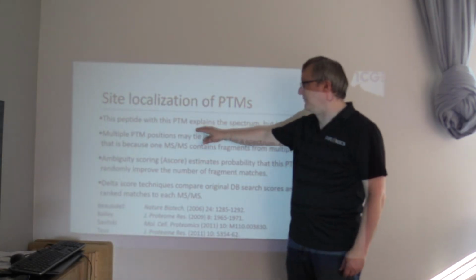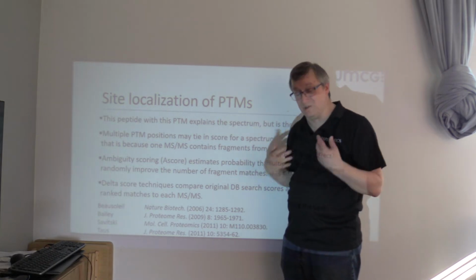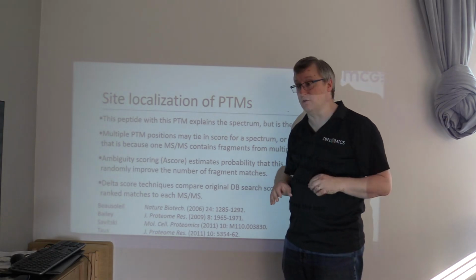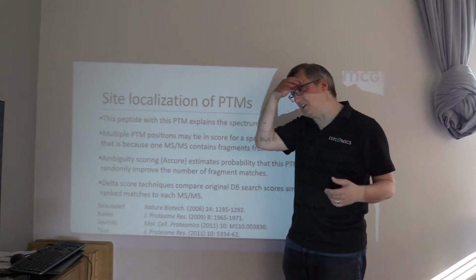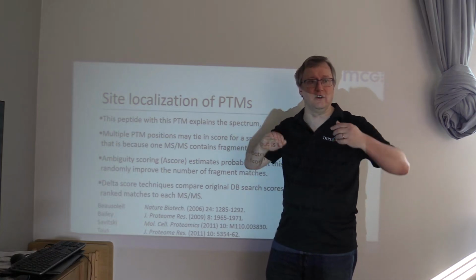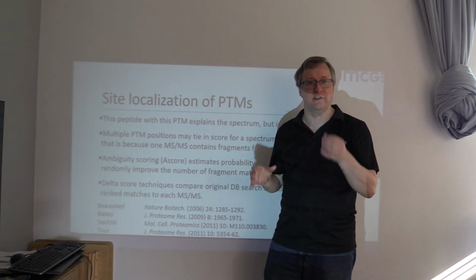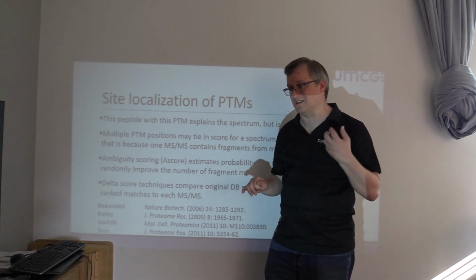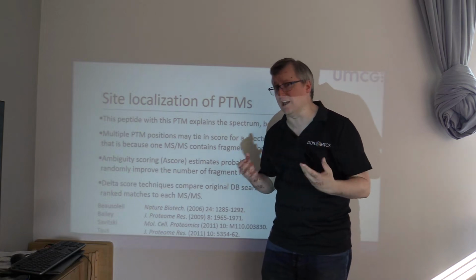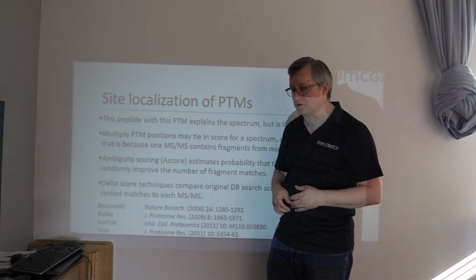So this peptide with this PTM explains the spectrum, but do we have the position of that PTM correct? Very frequently, if you're making a big announcement about some PTM that you've discovered in a Nature Biotech paper or something, you're going to need to justify that this modification is the only real explanation, and to be really clear about just how much information you have for localizing it to this position.